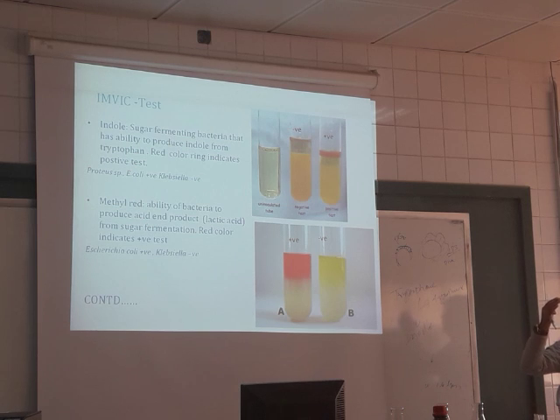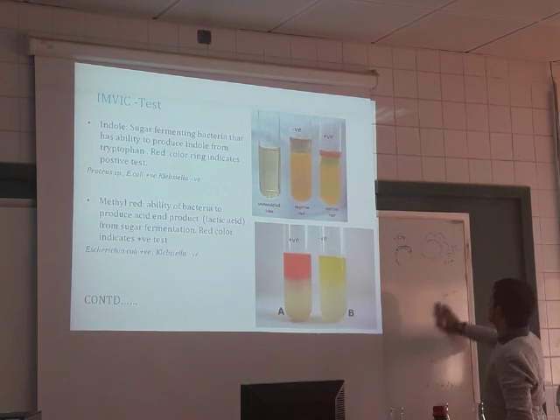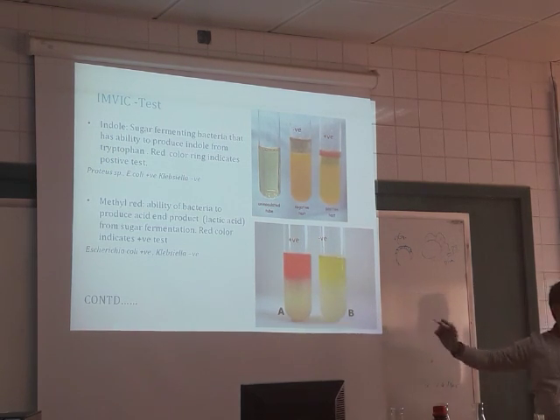Bacteria break down the amino acid tryptophan into indole. Indole is ring shaped. Why does it break down? Because the bacteria have the enzyme tryptophanase. Next, methyl red. Methyl red is a test to see whether bacteria ferment glucose or not.